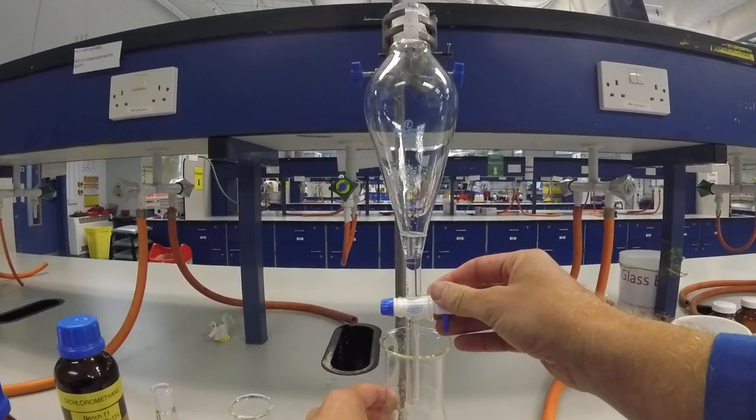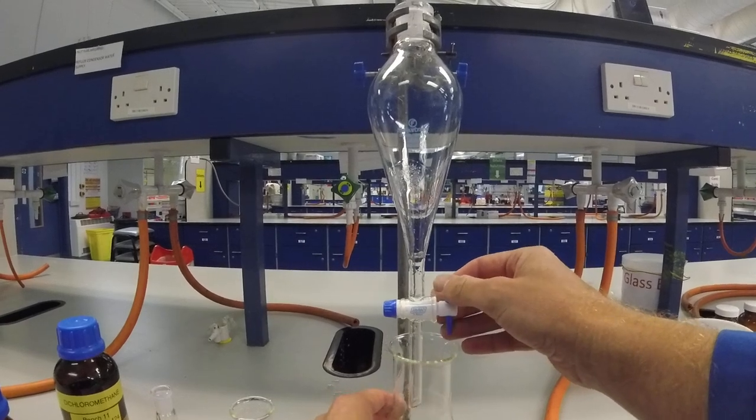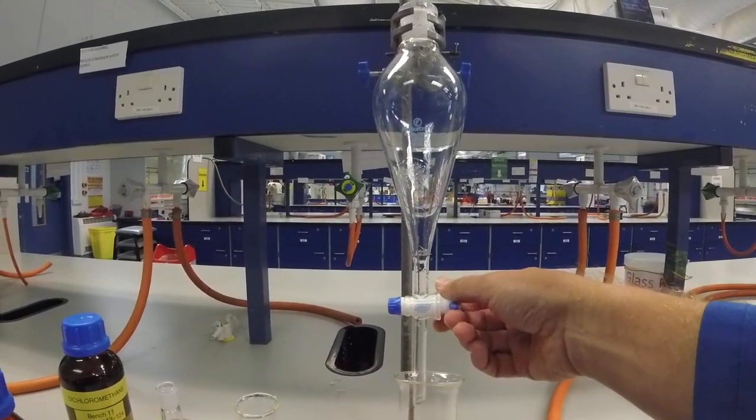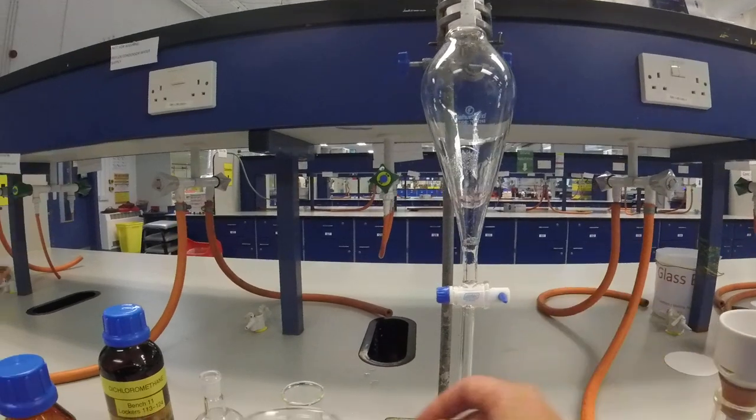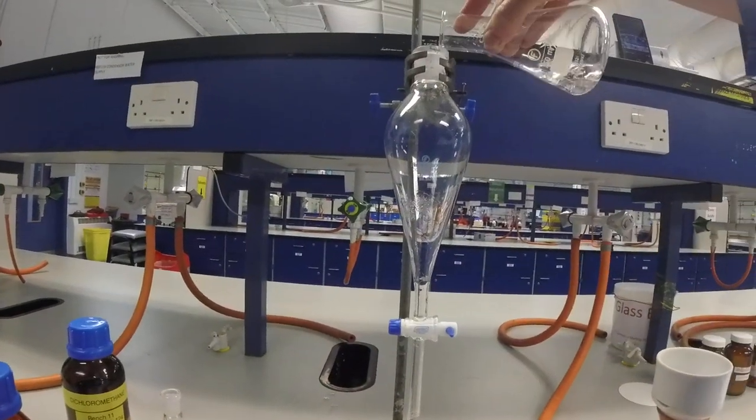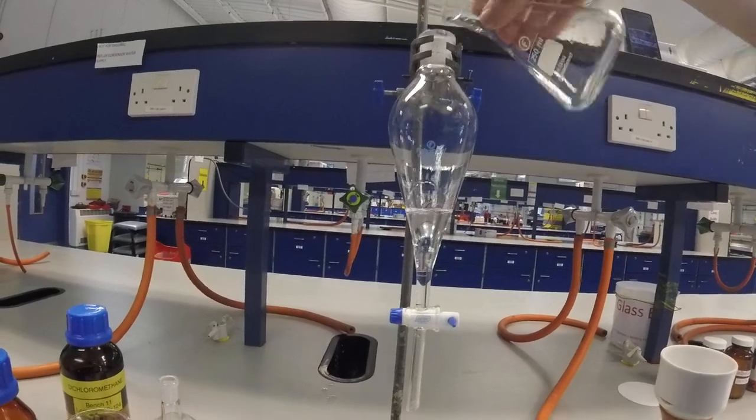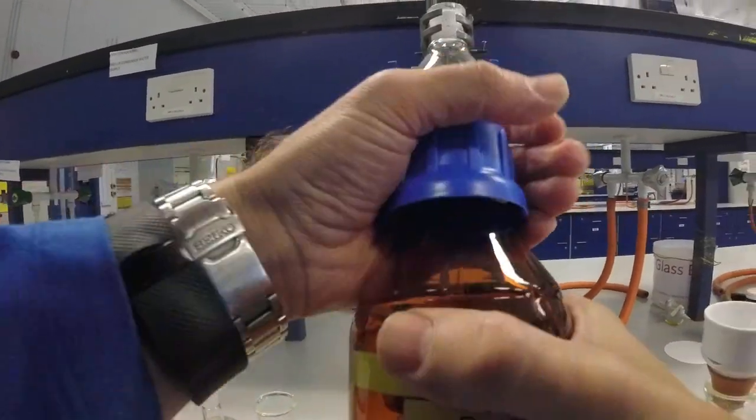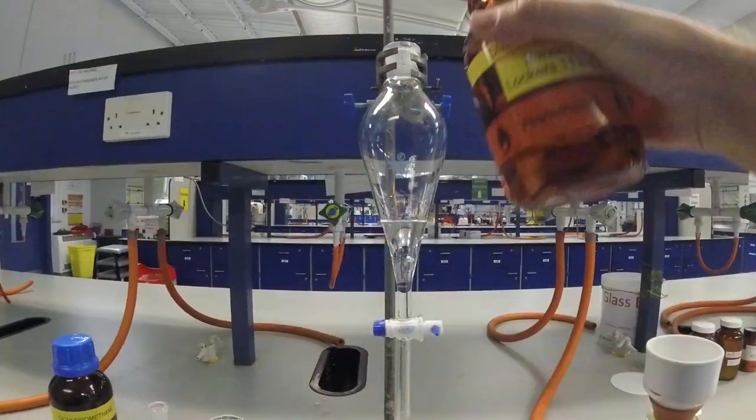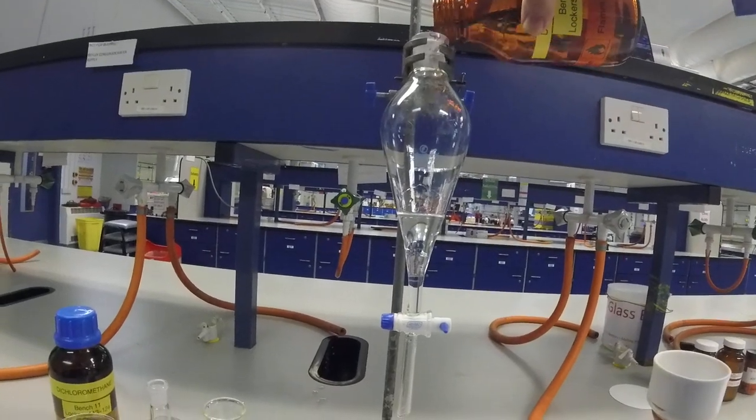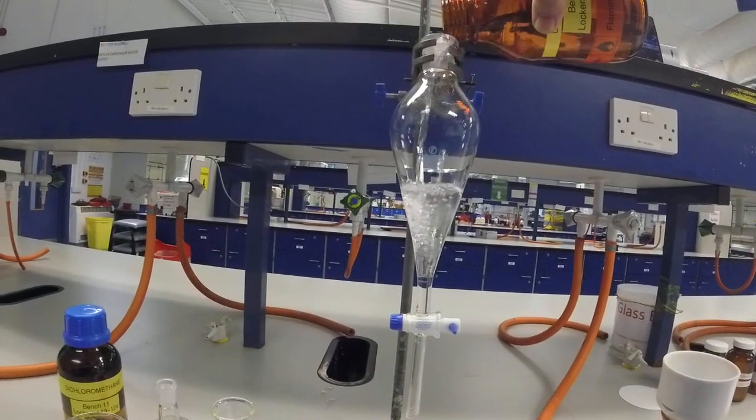And sometimes some of our product will still be mixed in the water layer as well. So what we'll do is we put the water layer back in. Take some fresh solvent. So in this case we're using ether. But it might be ethyl acetate or dichloromethane.